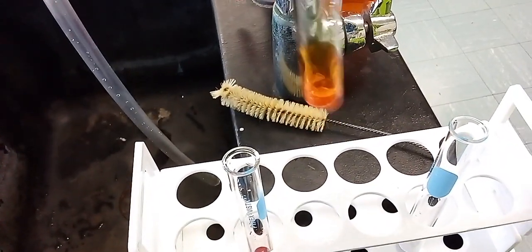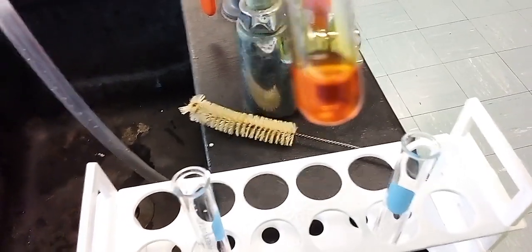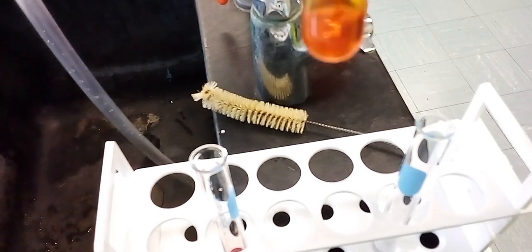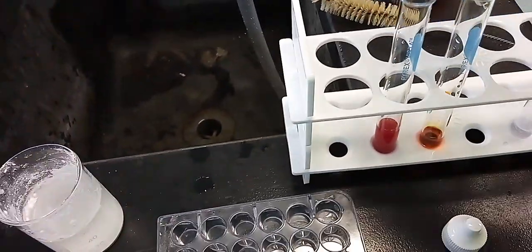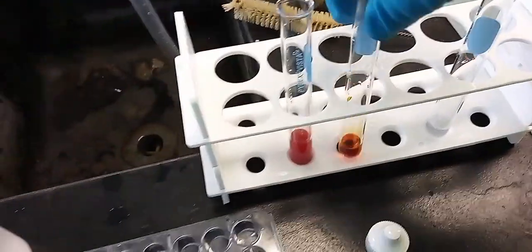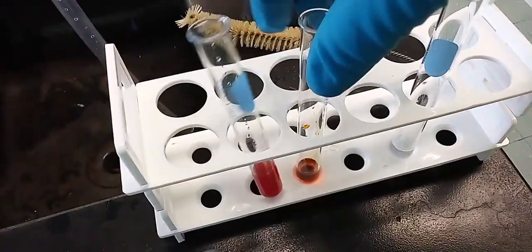So yeah, you can see that it's kind of yellowish, orangey. It's a base. So this is a base. This potassium hydroxide in here, same color, methyl orange, yellowish, orangey color. And this here is red. This is an acid. This is a base.